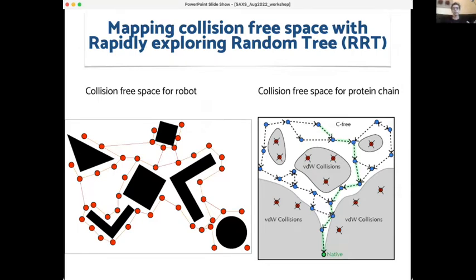This is not necessarily the lowest energy minima or anything like that, but this can be done very, very fast. If we want to sample interdomain motion using molecular dynamics that will go to the minima, it is really time consuming. Here we can sample quite a lot within minutes or maybe a couple of hours and generate quite a lot of conformations that cover the space very well.